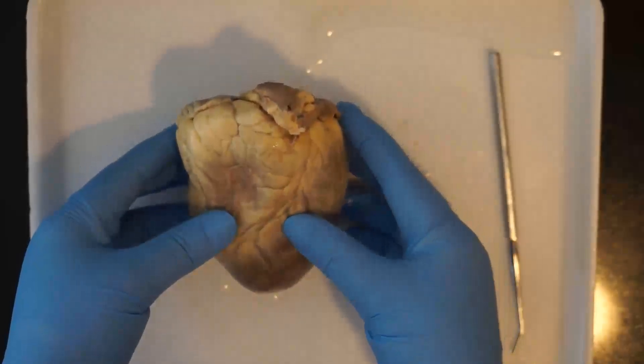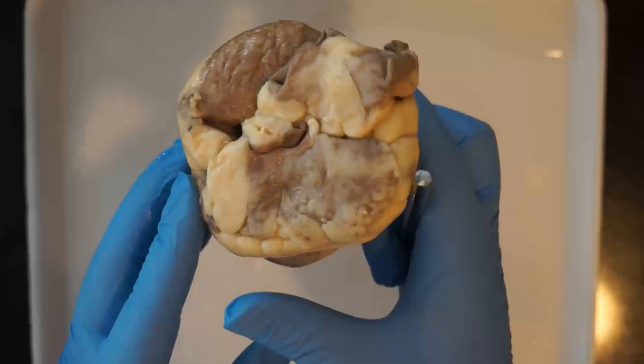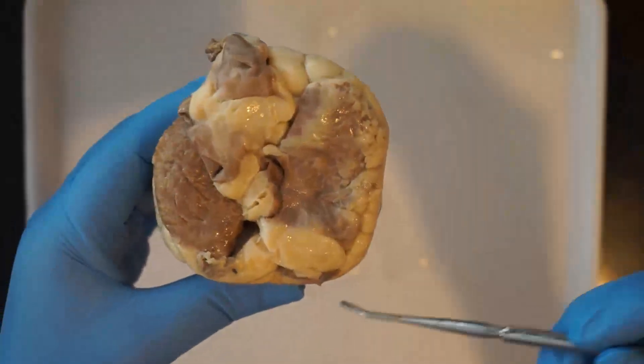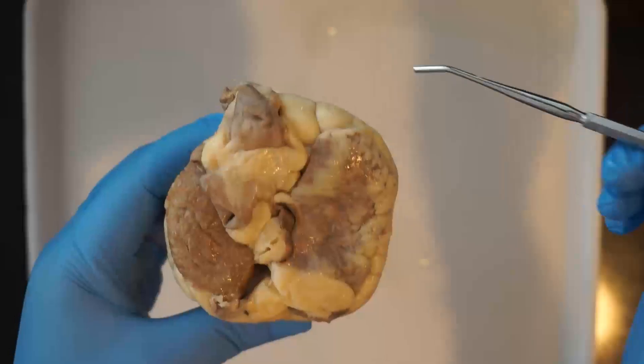Let's turn the heart around and take a look at some of the blood vessels coming in and out of the heart. Now we're looking at the back of the heart and the front of the heart now that we've turned it around.